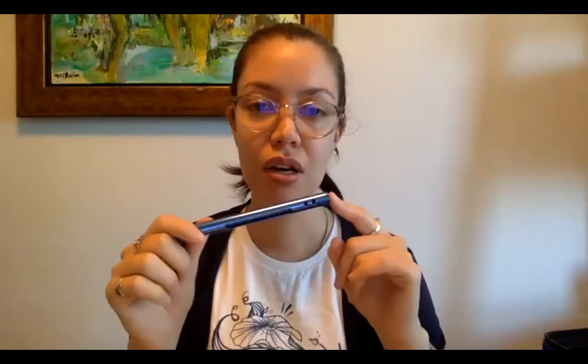And try not to rely on apps for the weather, because it's not always super specific to the area where you are. So that's why we ask people to take the temperature, and just wait 5 minutes before you take the reading. If you hang it in a tree, you can go do all of your other tests and then come back and take your reading. Just make sure not to forget it in the tree, which I have done many times.